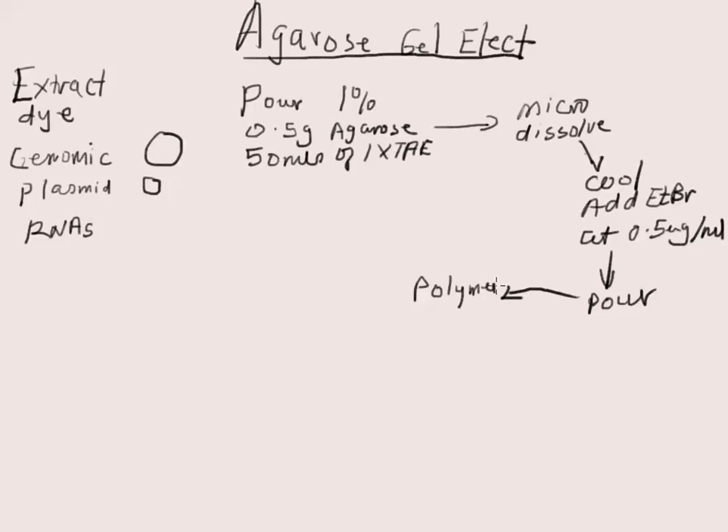Then remove the comb and pour 1x TAE buffer into the troughs — both troughs — until the buffer completely covers the gel. Now we need to orient ourselves here when you have the gel set up.